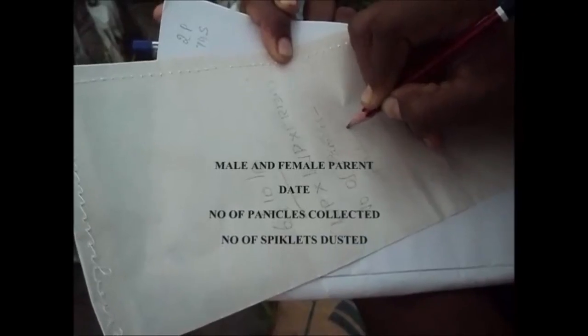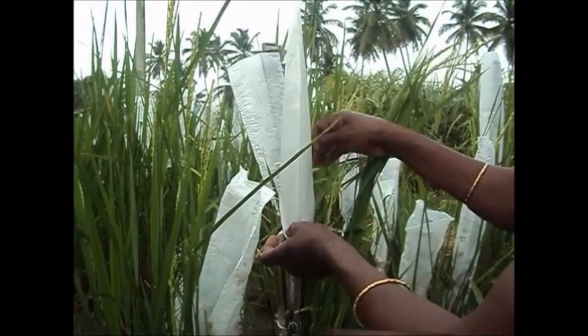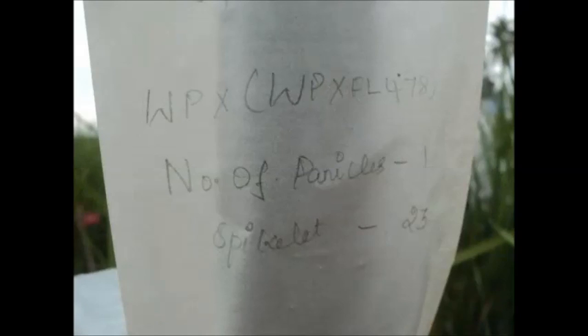The following data are recorded on the butter paper bag: male and female parent, date, number of panicles collected, and number of spikelets dusted. The spikelets are covered immediately after artificial crossing. These are the data recorded on the butter paper bag.